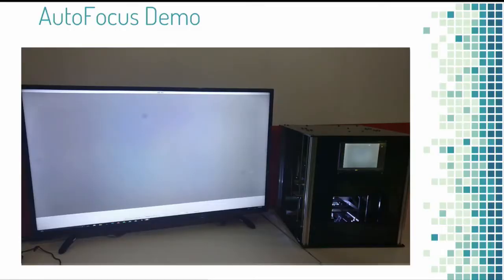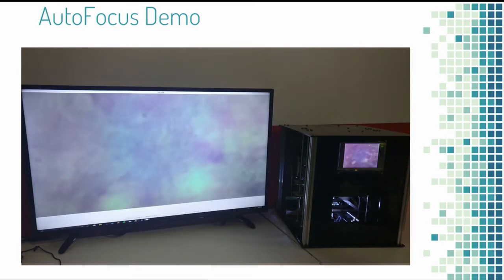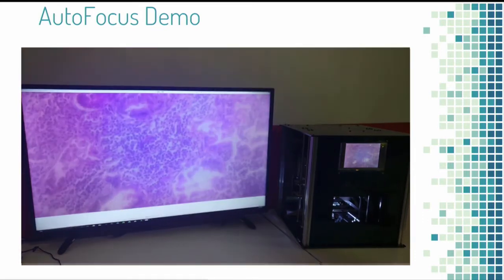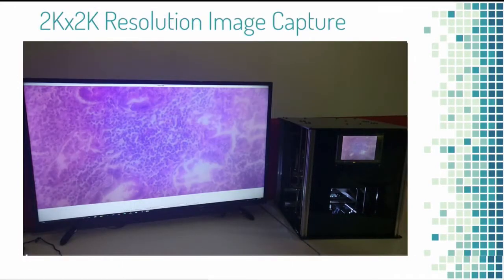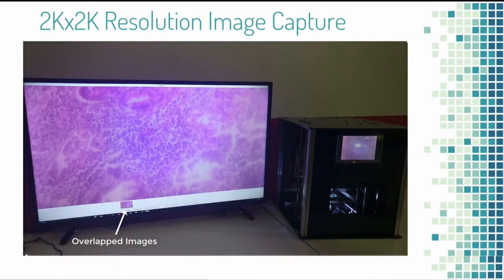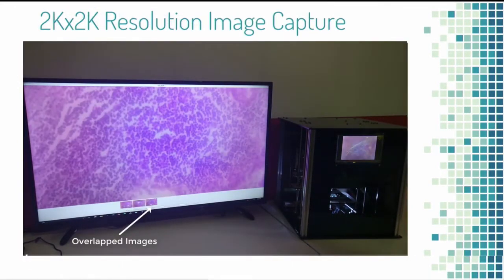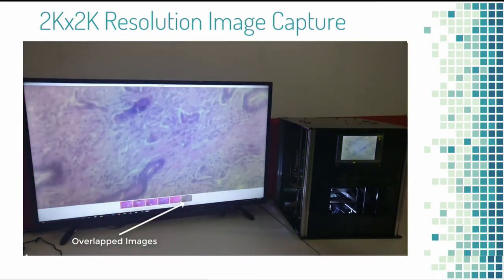This is a demonstration of my machine performing autofocus code, and it ends on a fully focused image. After the focus code is performed, it then performs scanning code, which captures overlapping images and displays them as thumbnails on the bottom of the screen.